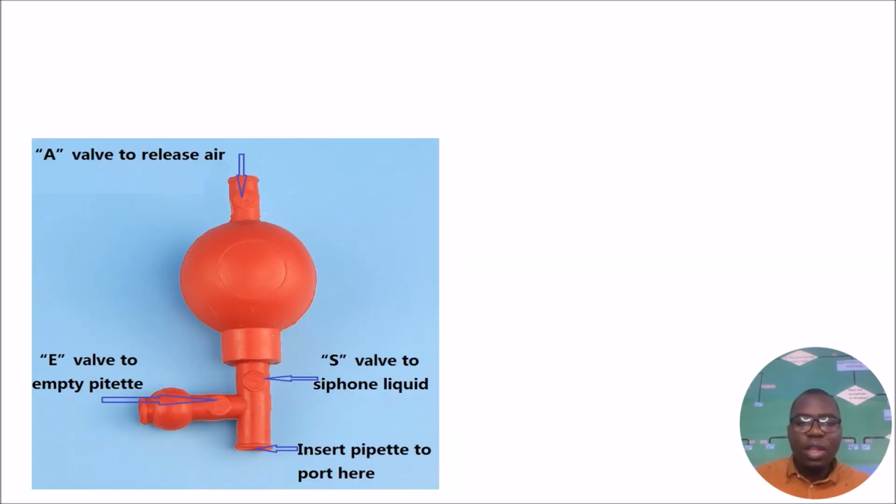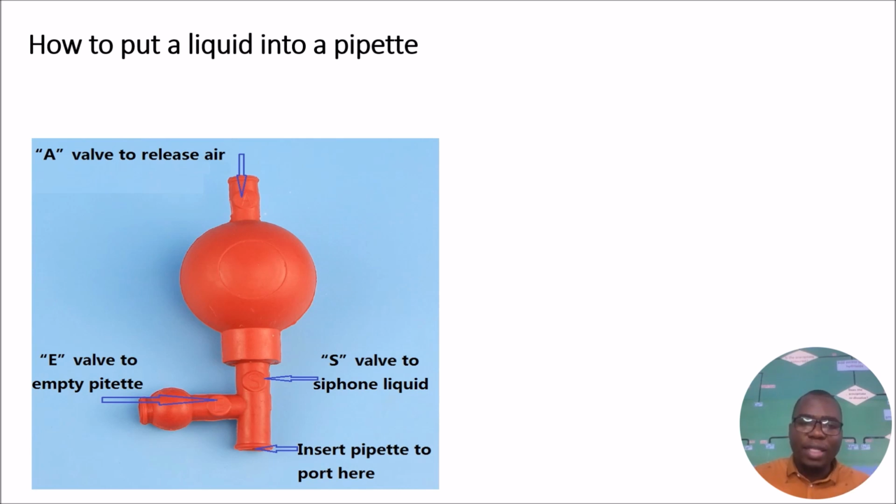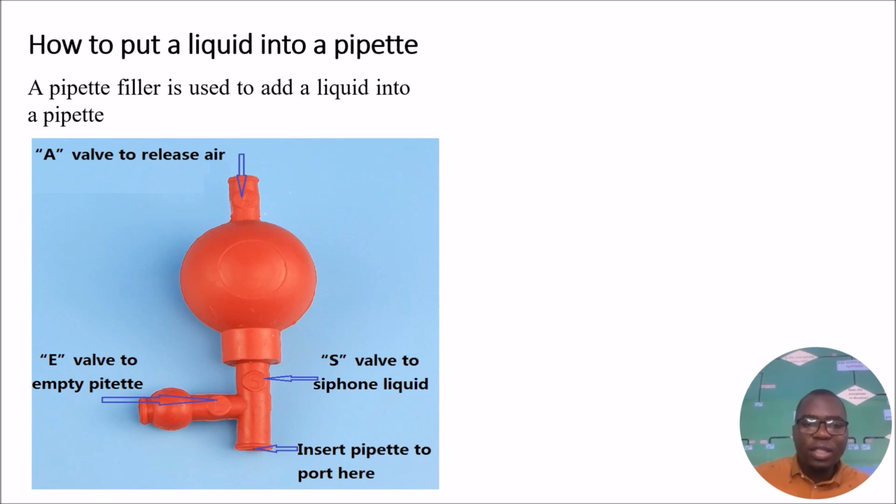Now the question is, how do you put a liquid into a pipette? We use what is known as a pipette filler. Now, the common pipette that you're going to see is as displayed here. So this pipette has got parts.